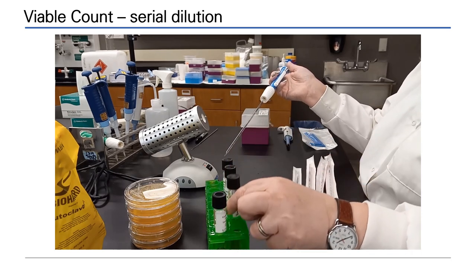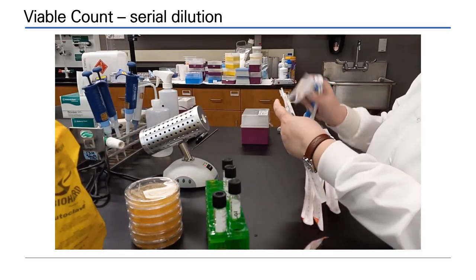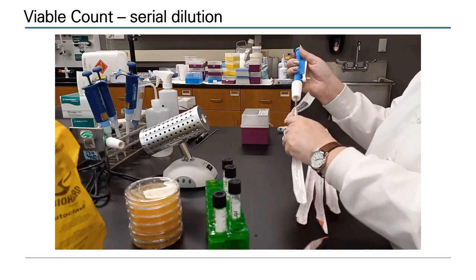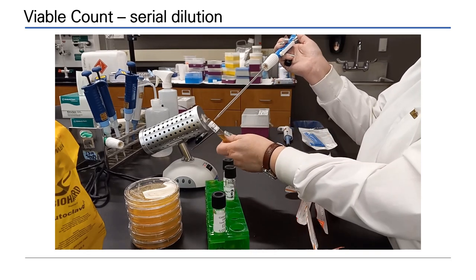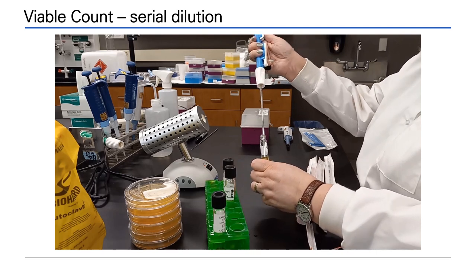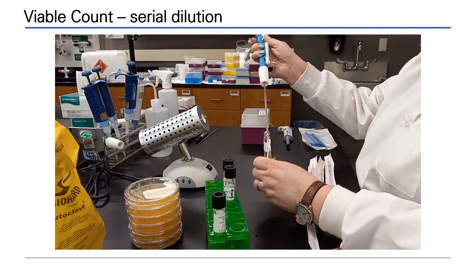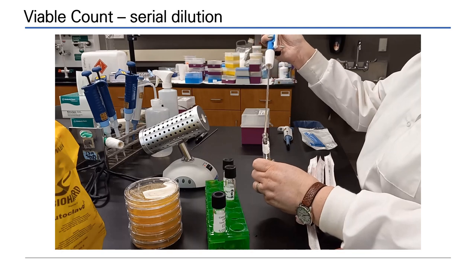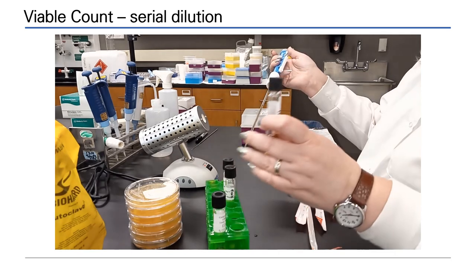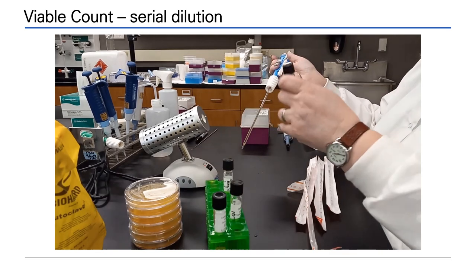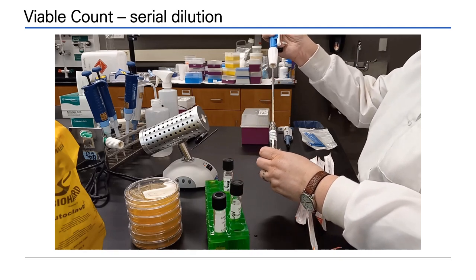Rather, place your cells back in the test tube rack and dispose of the pipette. Take a new sterile pipette. This will have no cells on the outside and will not raise the number of cells in the tube. So, first, re-suspend the cells in the 1 times 10 to the minus 1 dilution tube. Do this by gently pipetting up and down a couple of times. Finally, remove 1 ml of this sample. Aseptically transfer it into the next tube and dispose of your pipette.